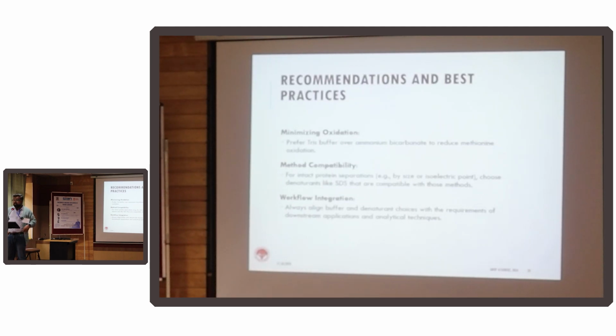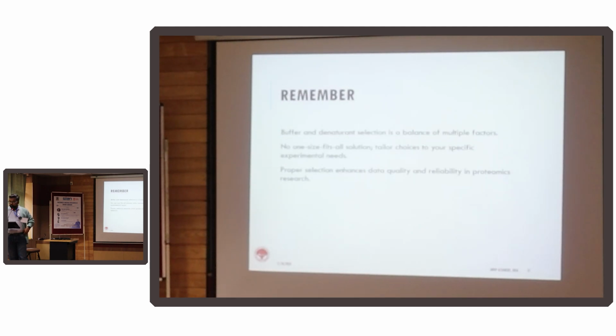Method compatibility: for intact protein separations, if you want to do intact protein by size, choose denaturants like SDS, and again you have to choose whether those methods are compatible. Always have this in mind, you have to go for workflow integration. So anything that goes downstream should be compatible with what is going on upstream, right? Again, one size fits all solutions are not available.